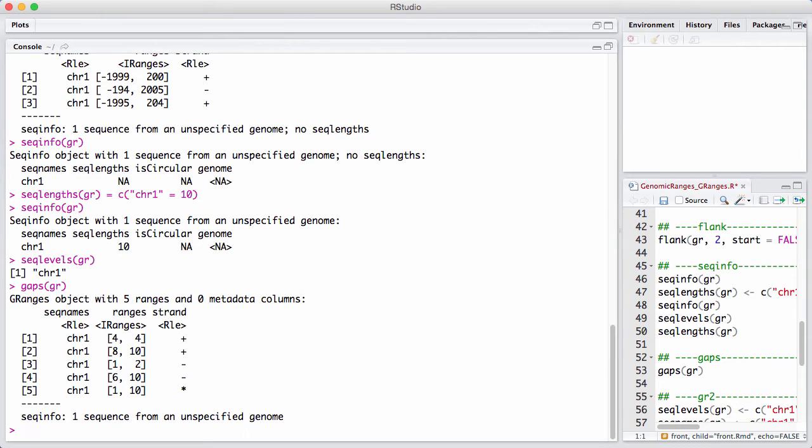Furthermore, you can see that all of the ranges end at 10, because that's the end of the chromosome. So we know that's where it stops.